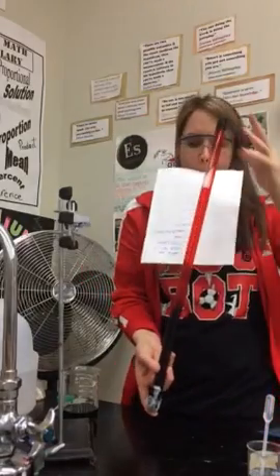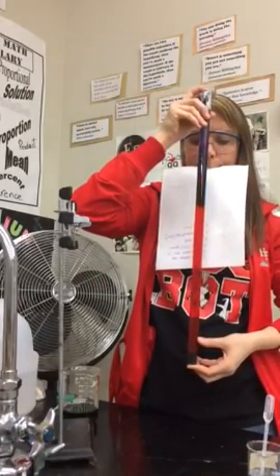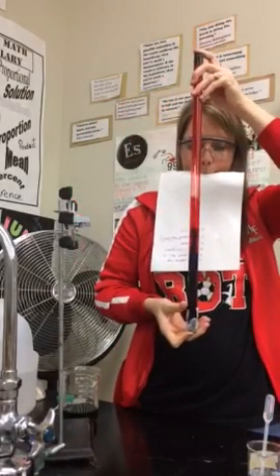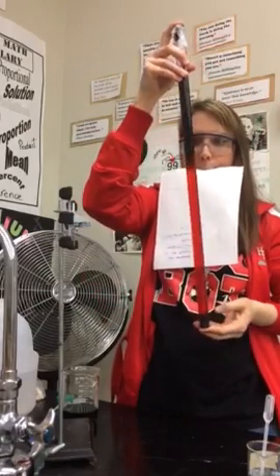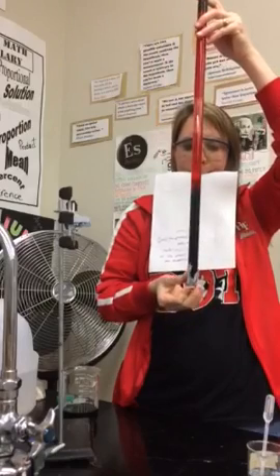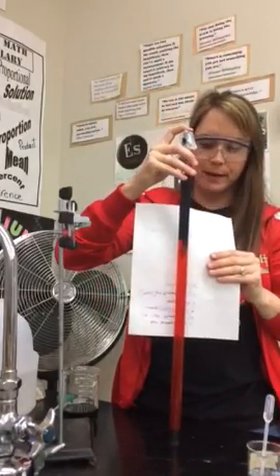Let's do this. We're trying to create that rainbow in a tube.